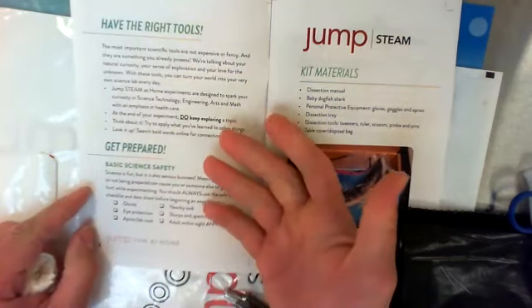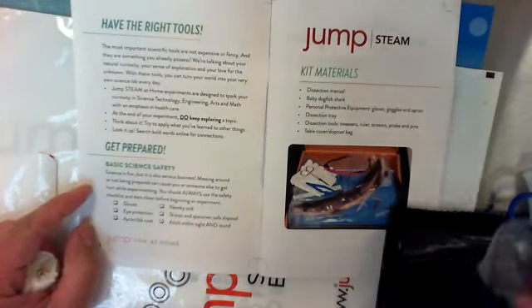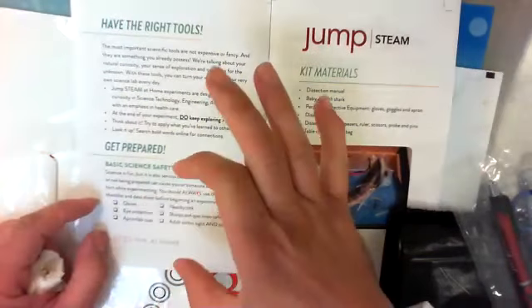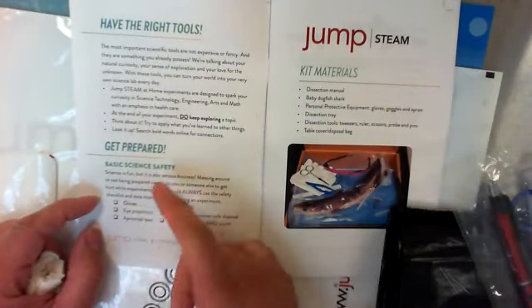But it's a preservative. It's to preserve things in your house, preserve fish, sharks, animals. I have a brain that's behind me that's soaking in a jar of formaldehyde. So we want to protect you and keep you safe. The first thing we're going to do is make sure you have the proper personal protective equipment, which is PPE.